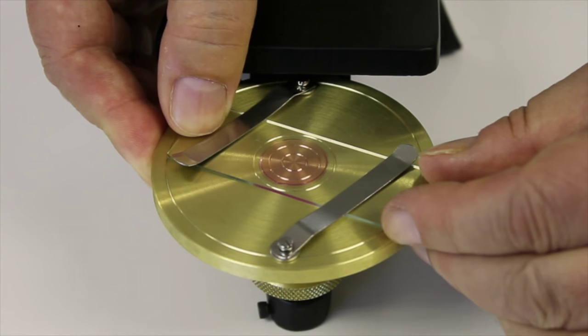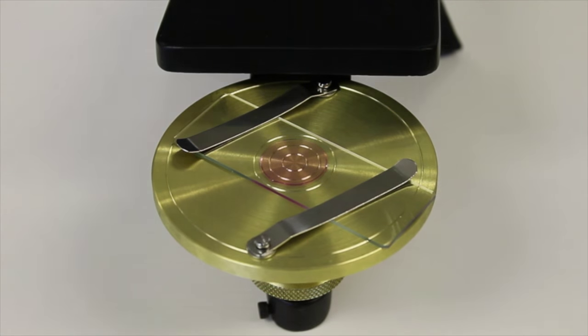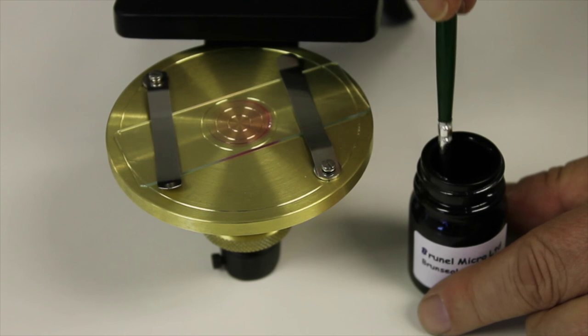The ringing cement used in this demonstration is Brunsil Black to make the process easier to see.